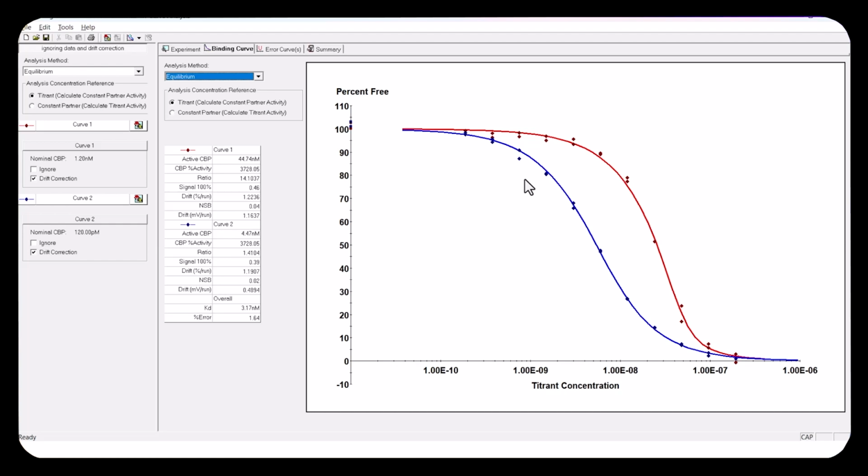If it does, I wouldn't trust it. If you can turn on drift and it changes your values significantly, that alone is a reason not to use it. And you should look deeper into your data to understand what's going on.